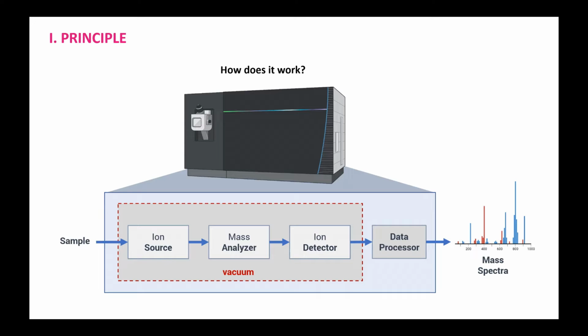All the three components are available with variety in techniques. Selecting specific ones and the realization of the protocols require consideration of the sample you are working with and the goal you want to achieve. But first, to understand its principle, let's look at the simplified model of mass spectrometry in action.